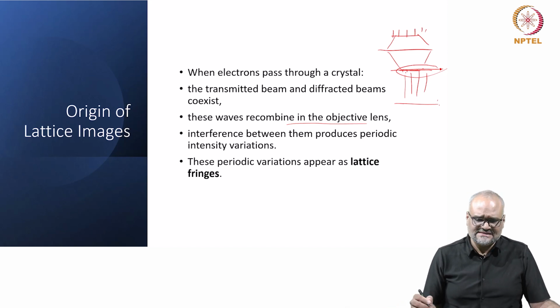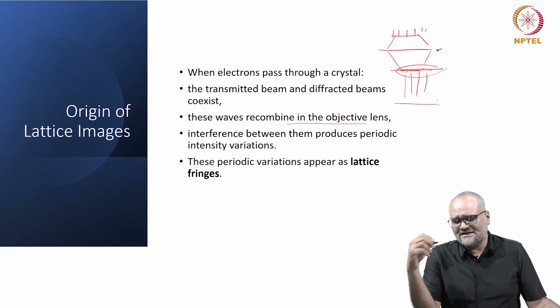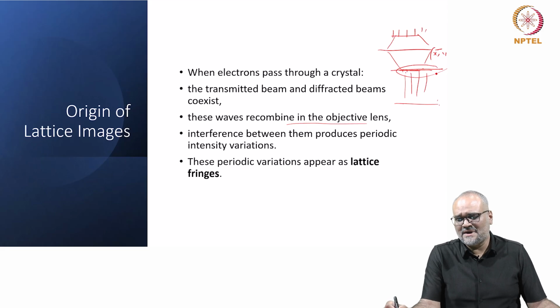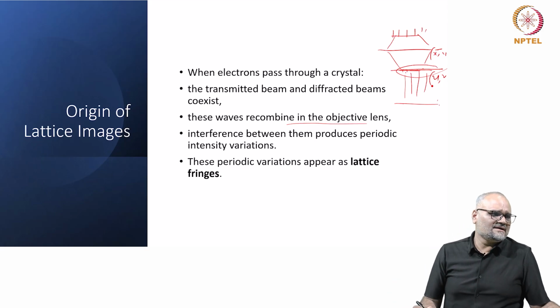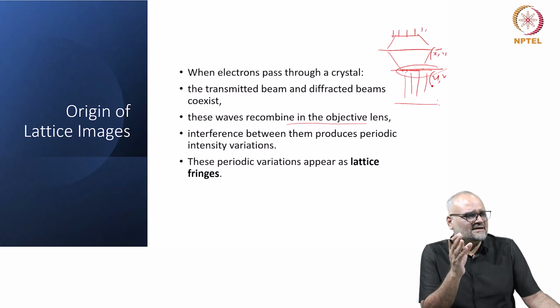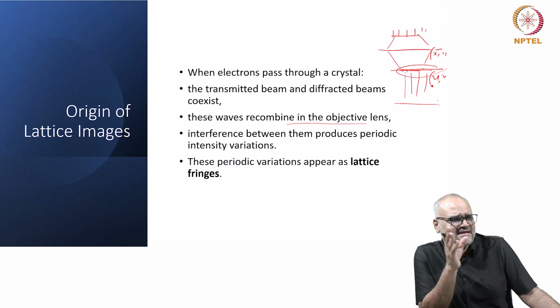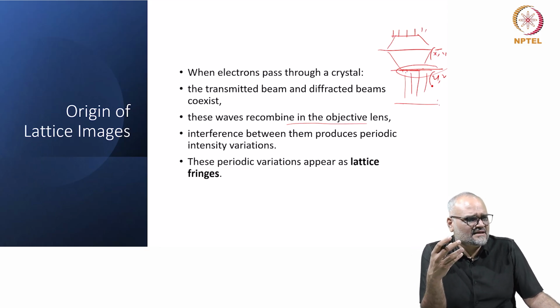So, you will see at a later stage that I can modify the object function that is written in the spatial domain in x and y, and represent it in a frequency domain of u and v as well. The interference patterns are reconstructed in real space, but the reciprocal lattice vectors are in Fourier space.